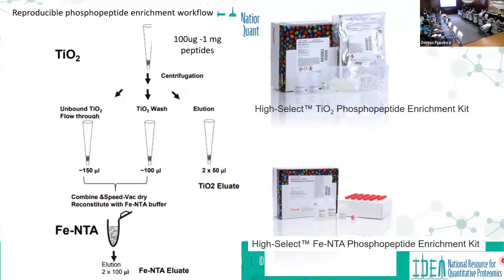And so instead of analyzing this separately and having those peptides that are binding to both be penalized, because when you analyze them, they're half the abundance, halves in one, halves in another, we combine them and we fractionate them. And then we spend a lot of mass spectrometry time trying to identify them.